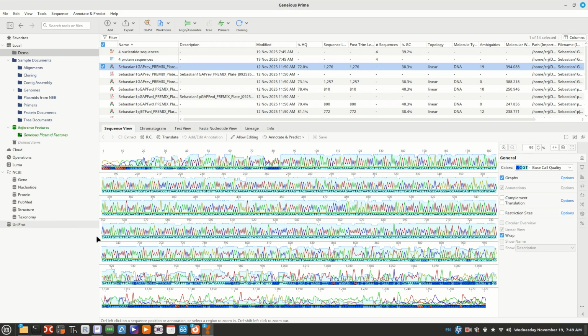Now this we'll stop and talk about for just a second, and here are those Ns down here. See how the lines, it's ambiguous what the read is. In other words, a read is this little peak here, and if it's very strong, for instance very strong for A right here, and it's got these three little A peaks, it's a pretty good sign that that is an A.